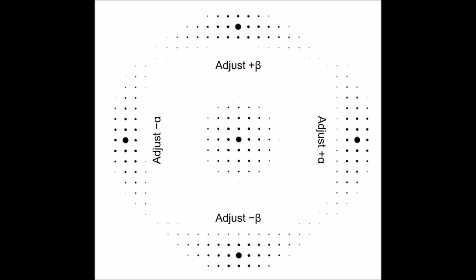And then we have 4 other diffraction patterns. You can see obviously the direct beam in each one. That's obviously the center of the pattern. That's where everything's relative to. So if we look at the pattern that's at 12 o'clock, the top one, you can see that I have basically an arc of a Laue circle, which I've talked about in a previous video about zone axis alignment. You can see basically though that the spots in the pattern are curving downward.